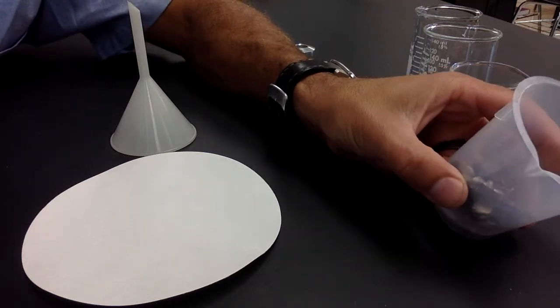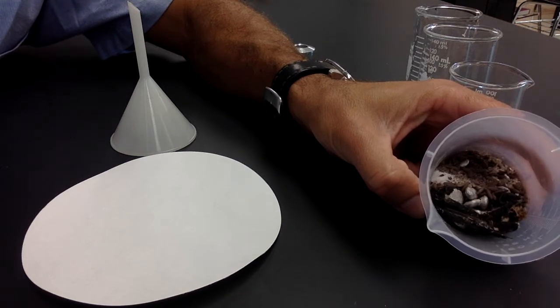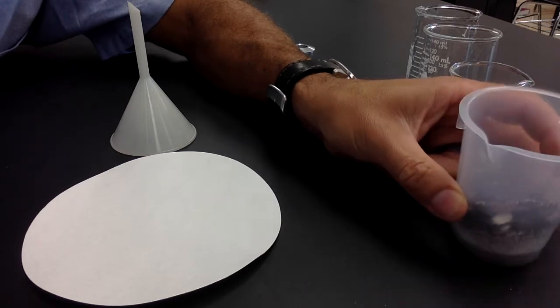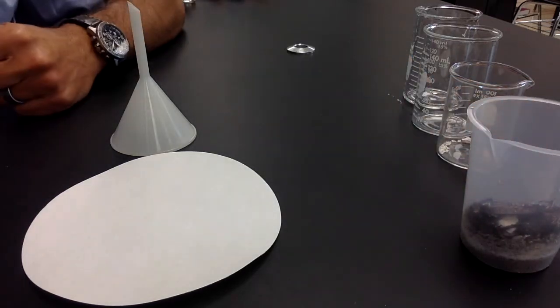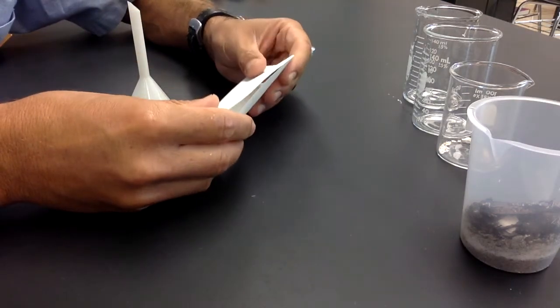Today in class, you worked on separating a mixture of sand, salt, iron, aluminum, wood chips, crushed seashells, and rice. At the end of class, we discussed which of these were the easiest and which were more difficult. The sand, salt, and crushed seashells were the most difficult to separate from one another. So tomorrow in class, you're going to need to use a method of separation called filtration.